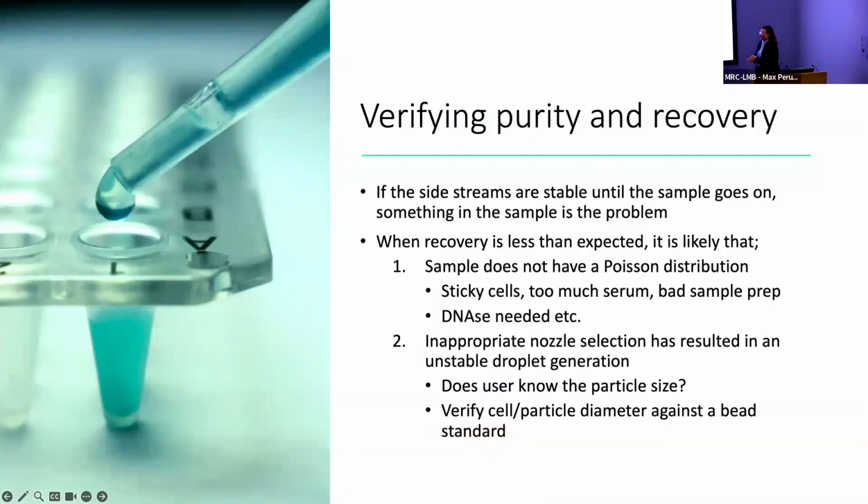In other words, you will potentially get more than one particle, or a swarm of particles, hitting the laser simultaneously, and that will reduce our ability to isolate your populations of interest. As we all understand, this is a high-throughput single cell technology, so we really need to make sure we're adjusting our settings so that the cells are only coming in one at a time.